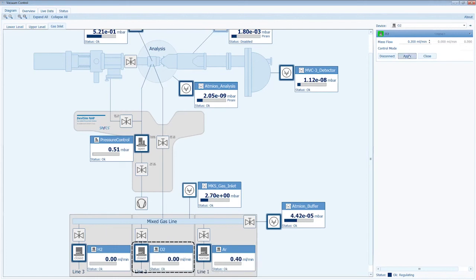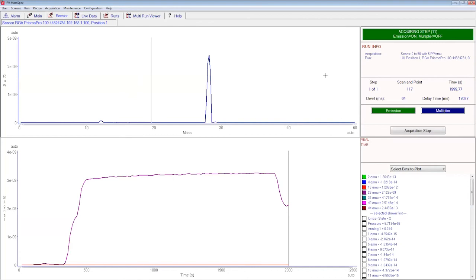So now we can try to add some oxygen to the pressure. At the same time, if you can display the quadrupole and put it on the screen. If I put it here, will it be visible? Yeah, so I can put it here. You see that the pressure, also the signal from the quadrupole from CO, decreased. At some point, we should start to see the 32 signal. So here, the little bump. Yeah, it starts. And 32 and 16 will be seen. Okay, it's coming.